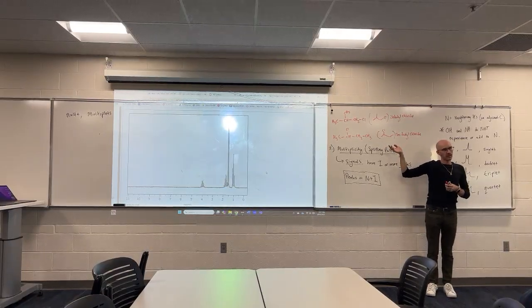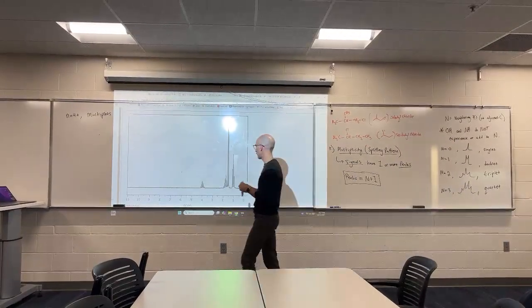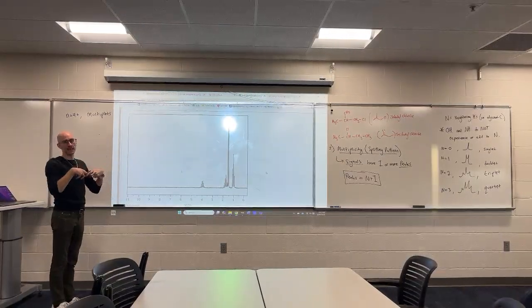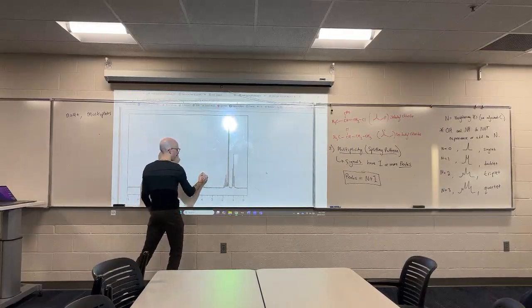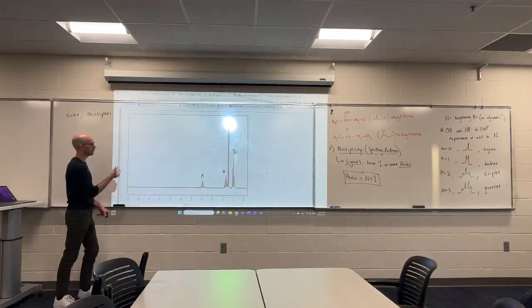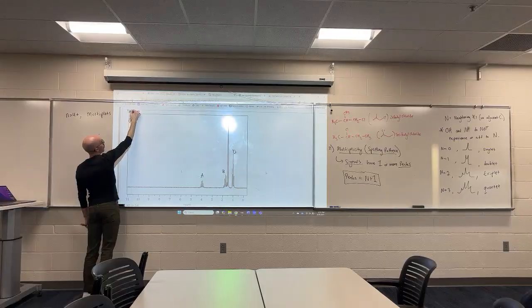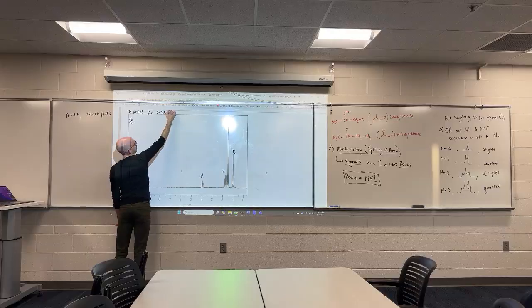So let's prove it. Let's prove that these hydrogens give the splitting patterns we would expect. There's two ways that we can do this. I want us to take the NMR and extract information about splitting pattern and neighbors. So I'm going to call these peaks A, B, C, and D. And by the way, if you want to have this in your notes so that you can reference this, we are looking at the H1 NMR for 2-chlorobutane.